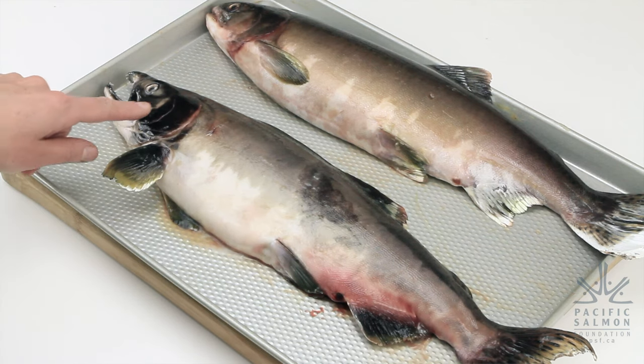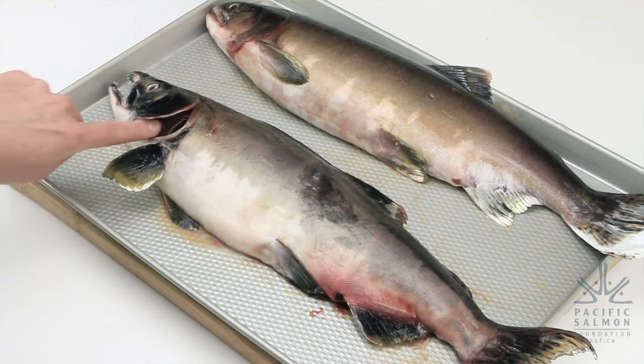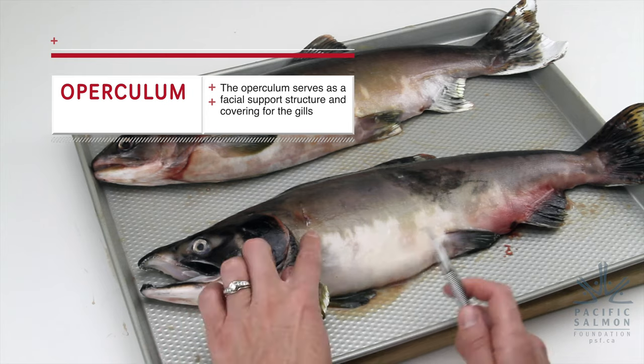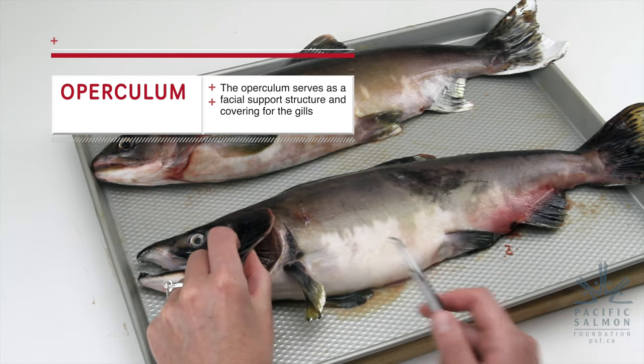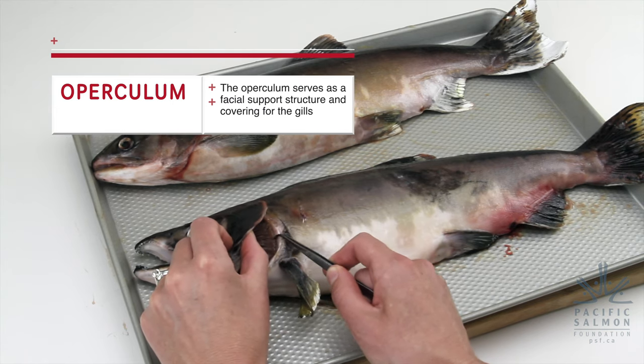We'll get into the external features of the fish starting with this fleshy piece of tissue, which is called the operculum. The operculum's main purpose is to cover up the gills and protect them, because they're very fragile.